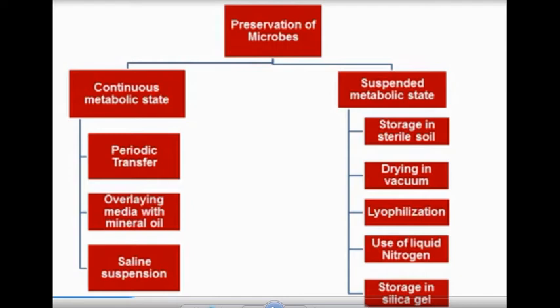Coming to the method of periodic transfer, which is widely used in small scale laboratories or research organizations or for the purpose of laboratory experiments, the organisms will be periodically transferred into a fresh medium.